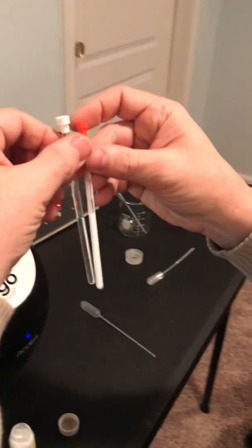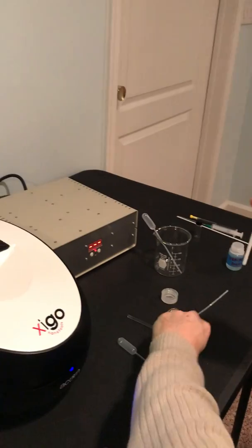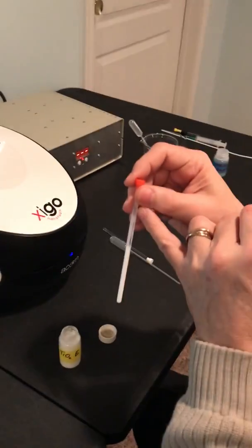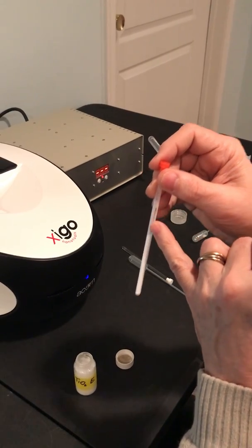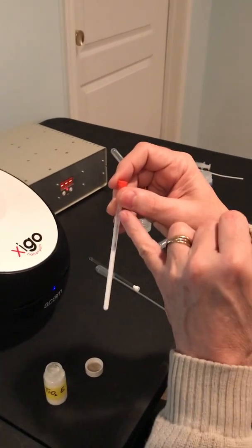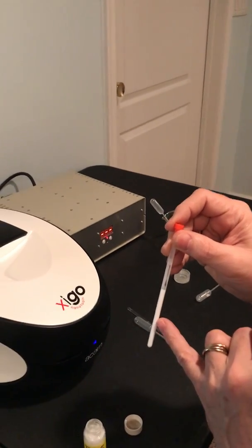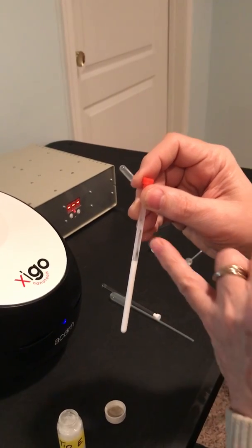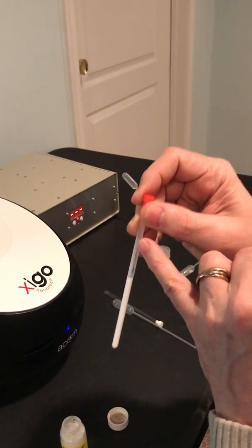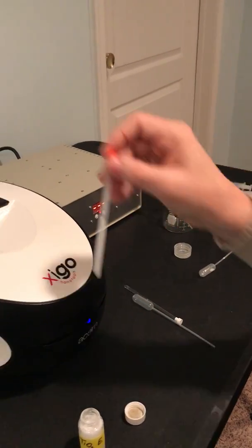And if we check, that looks pretty darn close. So if you add too much sample to this container, you're going to see noise in the results because the magnetic field far above the measuring zone, which is about here, a 13 millimeter length, 20 millimeters from the bottom of the tube, the magnetic field is a little bit different, so you'll see oscillations superimposed over the main relaxation.